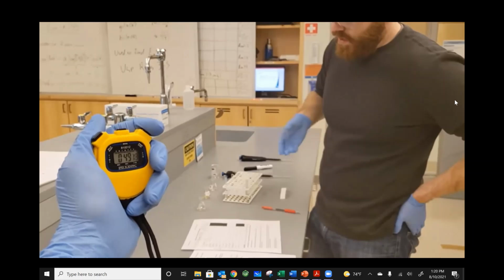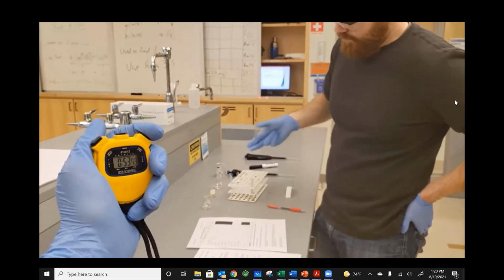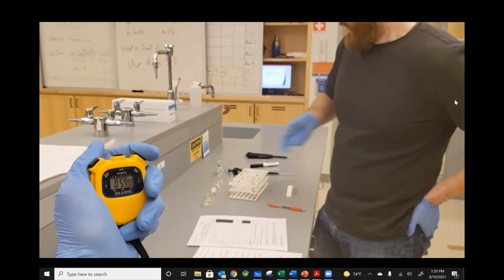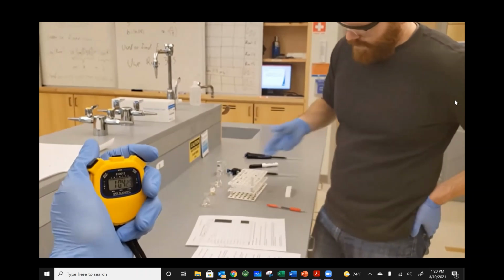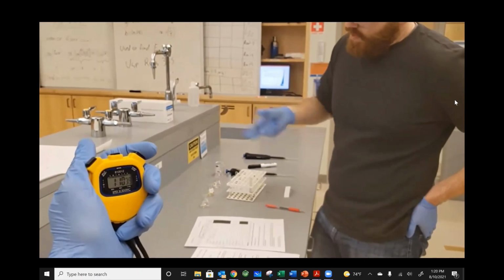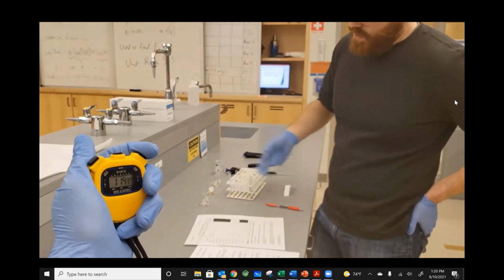And that should be occurring a little bit faster. We'll see. As I said in the pre-lab lecture, once that nice dark color forms, what that is signifying is that all of the thiosulfate has been consumed.